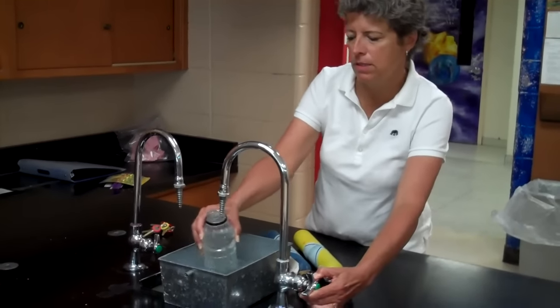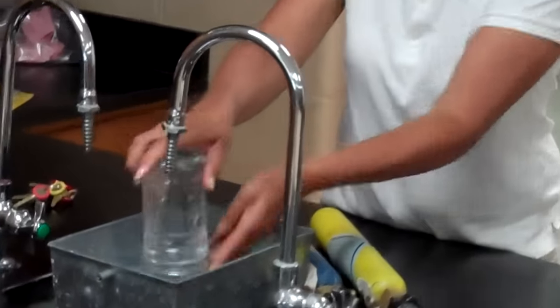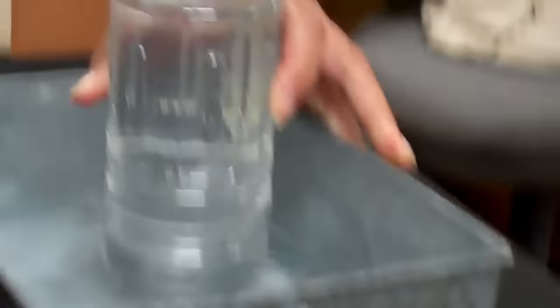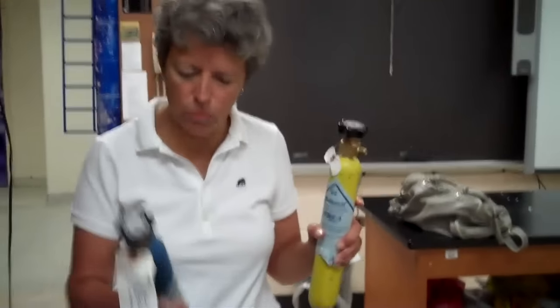We fill it right to the top and invert it into our bucket of water so that there's very little air in there, like that. And Stella, you're going to pick that up for me. And we have two containers of gas, one hydrogen and one oxygen.